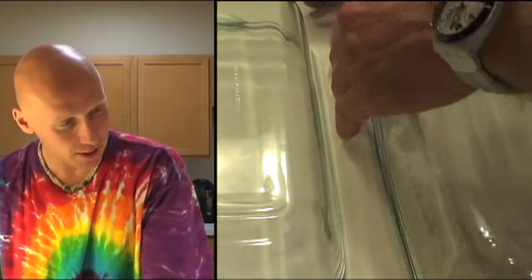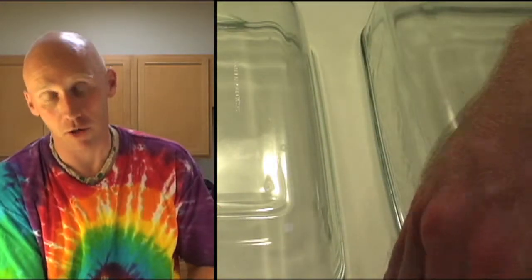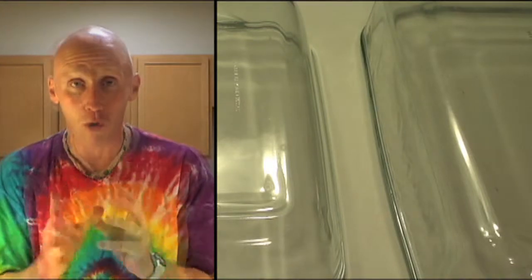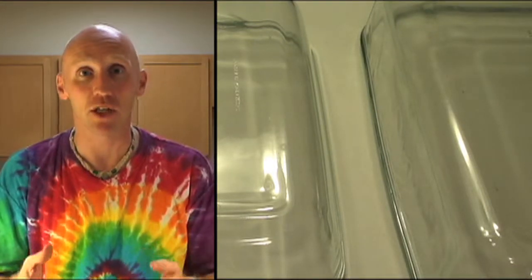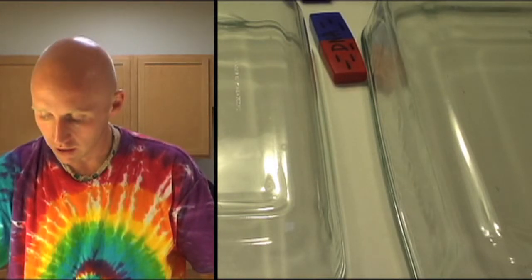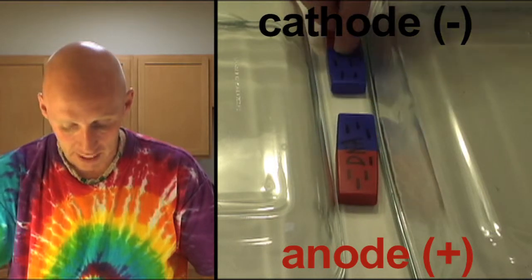Here, we'll consider this to be the pore, or a long pore that's running through the agarose gel, although the gel itself is actually made from thousands upon thousands of pores, and the pore size depends on the percentage of the gel itself.